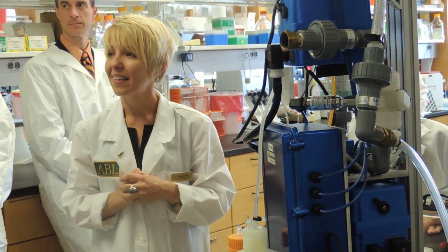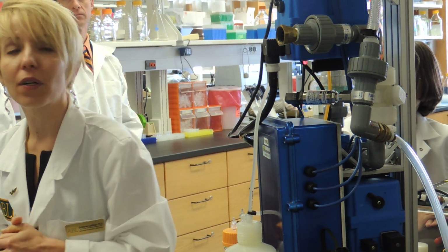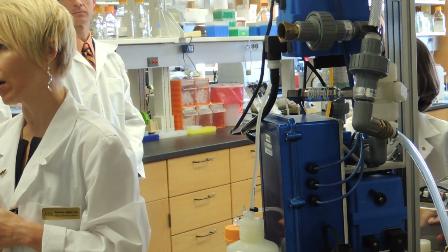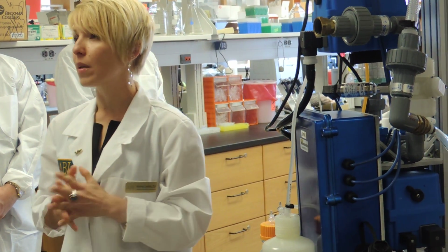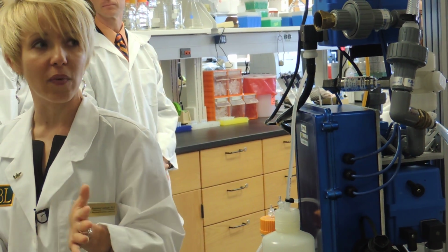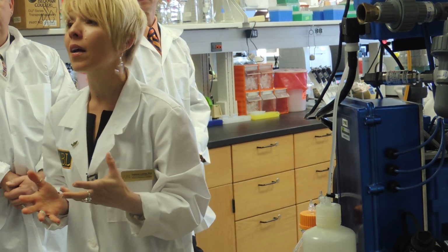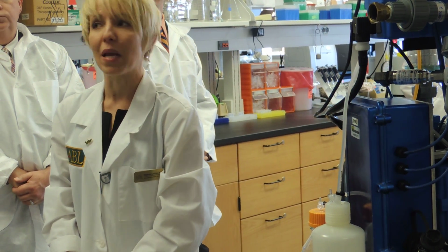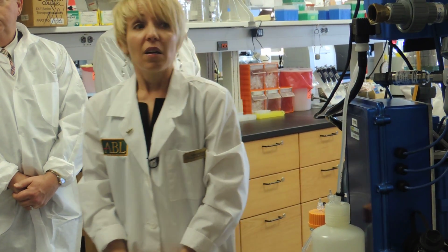Is this the total amount of time that it takes? The time that we're doing right now in this demo? Typically for collection, it's about 35 minutes for a 100-liter sample. For recovery of the sample, we have about a 10-minute incubation time that we allow that fluid to interact with the organisms against those fiber walls to increase our recovery. But the total active time that you're involved in the recovery process may be 5 minutes. Maybe. So the whole thing together, though, is going to be an hour?